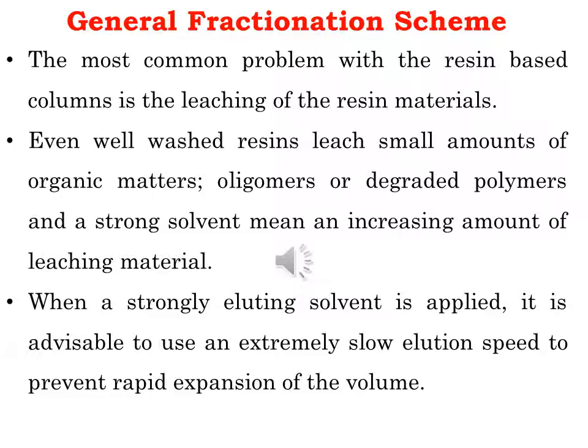The commercial resins are supposedly prepared in a certain range of mesh size, but friction during transportation and spontaneous cracking of these produce finer particles. Regarding the breakage of the particles, it is important not to dry the resin. The resin should always be kept moist with either water or methanol. The resin should be washed thoroughly with water or methanol and the solvent that one wishes to use. The use of a Soxhlet extractor is also a choice to wash the resin efficiently.